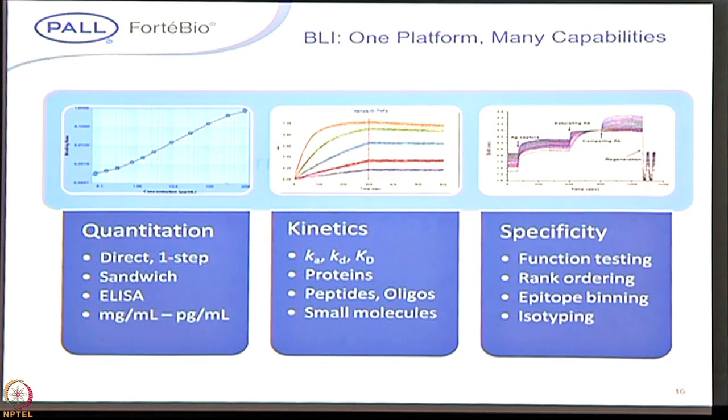And the epitope binning, we have dedicated software for the epitope binning. You can do the screening of where exactly your molecules bind. And the isotyping also, subtyping of your IgGs. So we have a lot of applications on this. I will go through those applications later.